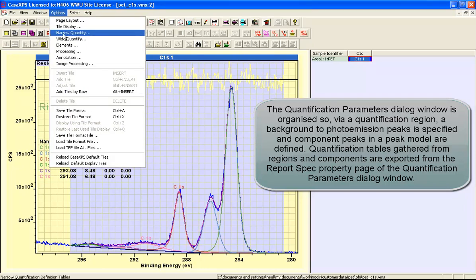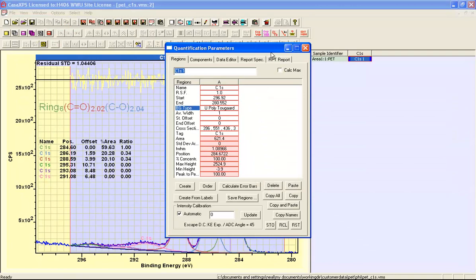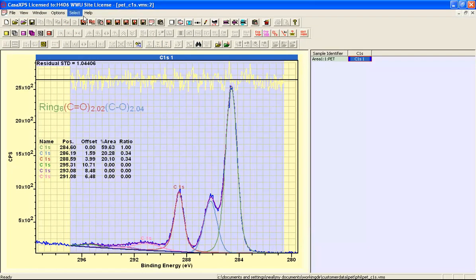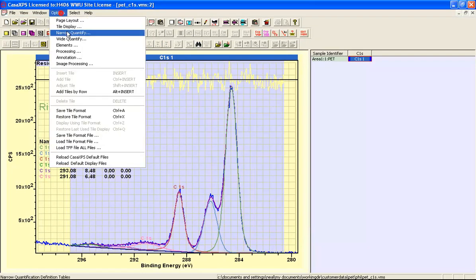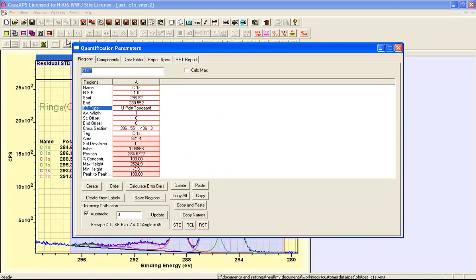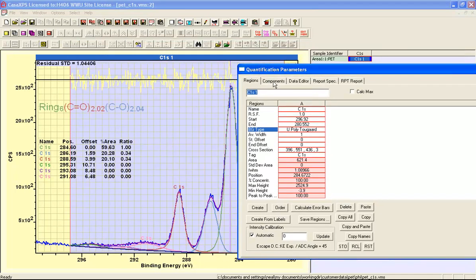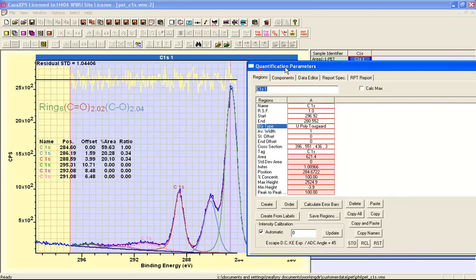There are two forms for the quantification parameters dialog window. You can either have a narrow form or you can have a wide form. I'm going to use a wide form for this example because I have a number of component peaks in this peak model.